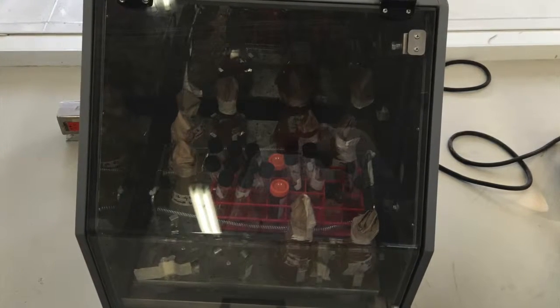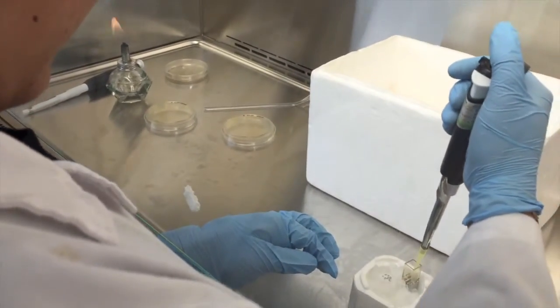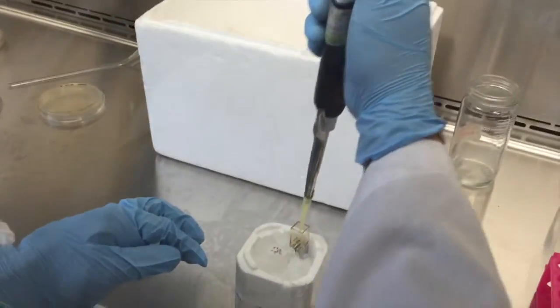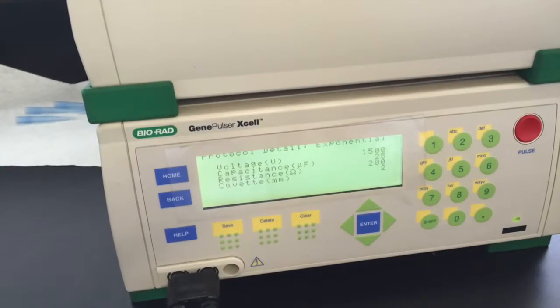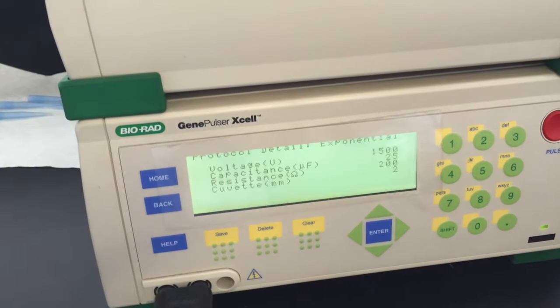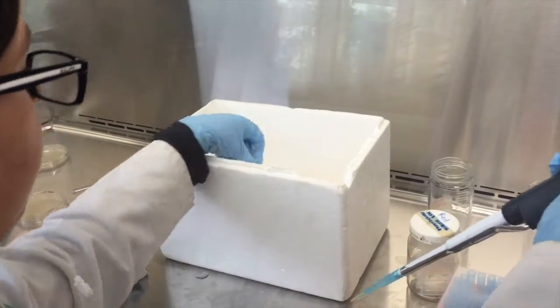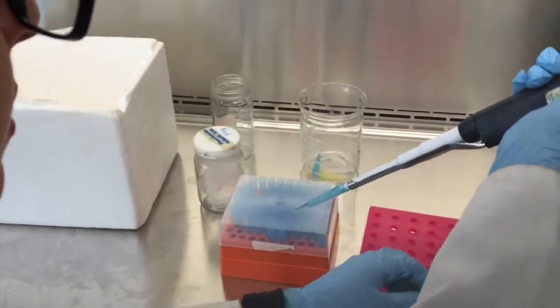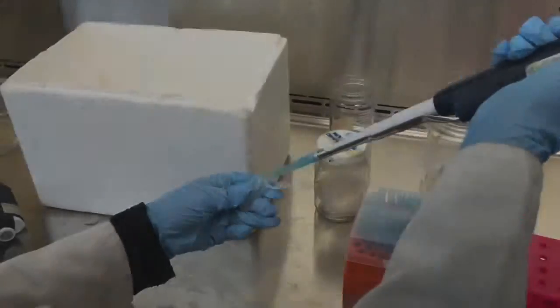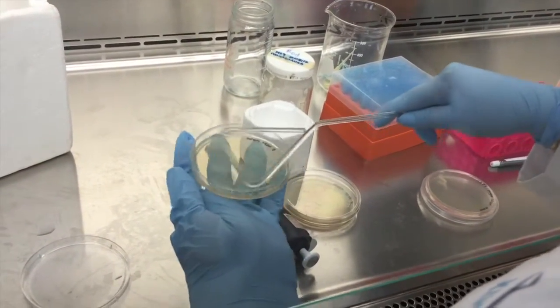A sample of 40 microliters of electrocompetent bacteria and plasmid were added in an electroporator cell. The electroporator was set at 1500 volts in order to give the pulse to the cells. 300 microliters of SOC media were added and the sample was incubated at 37 Celsius degrees during 30 minutes with shaking. Finally, the cells were cultured in LB plates and incubated.